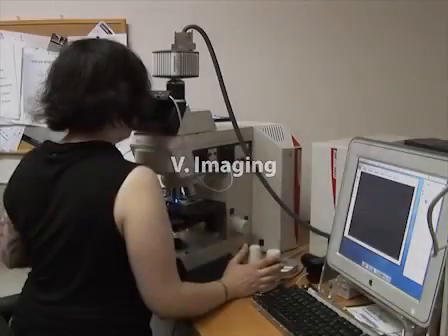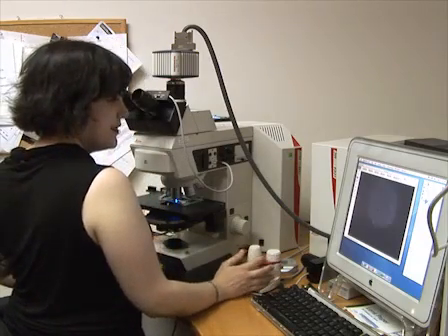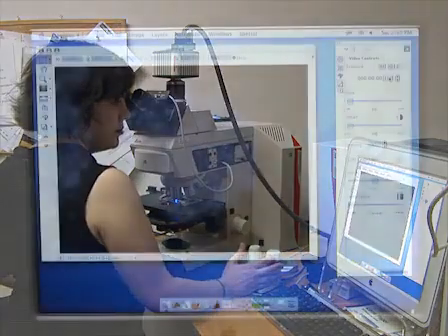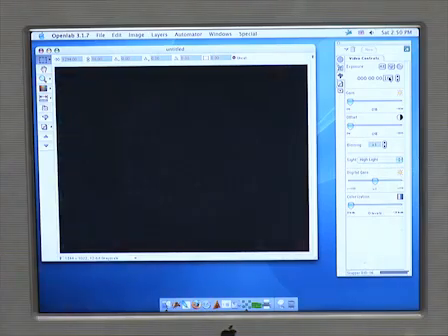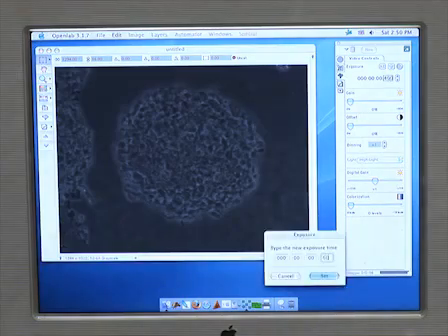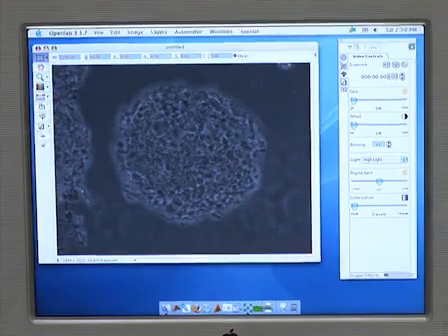When imaging, finding the cells on the slide is the hardest part. It will be easy to detect cells belonging to the sphere if you look for them using the nuclear counterstain. Once you find the beginning of the neurosphere, which may comprise only a few cells, image every section from then on, taking shots of the nuclear stain, your protein or proteins of interest, and a phase contrast image. This phase contrast image will be very important in the modeling stages.